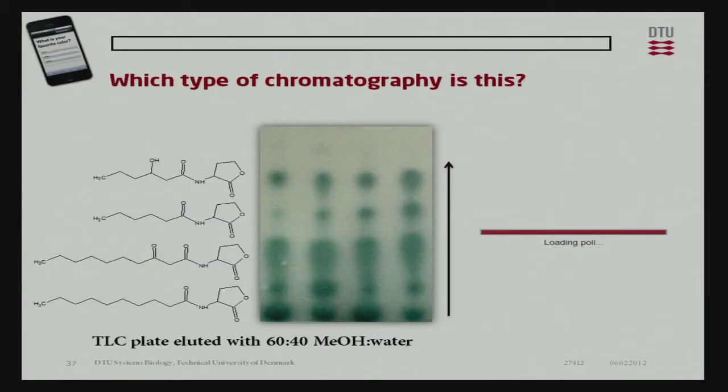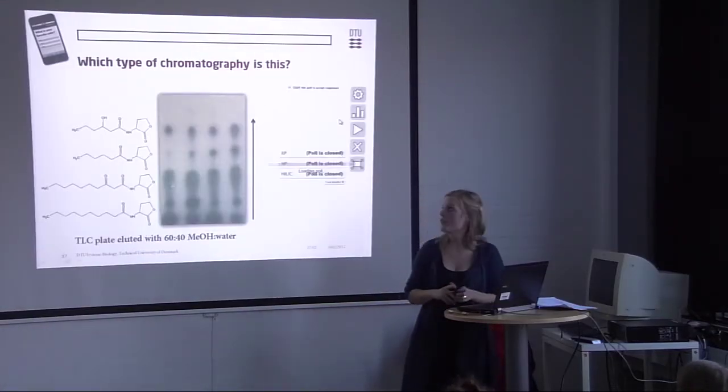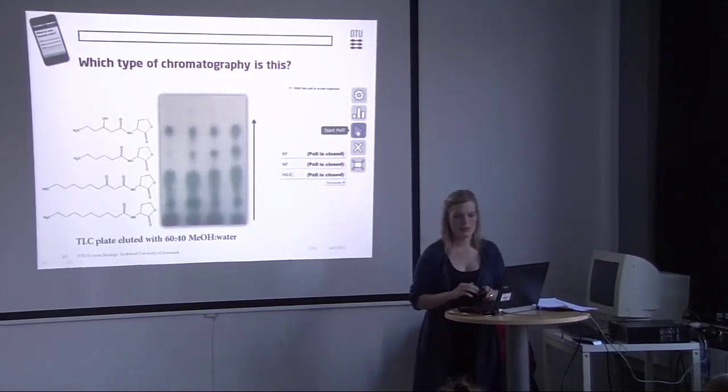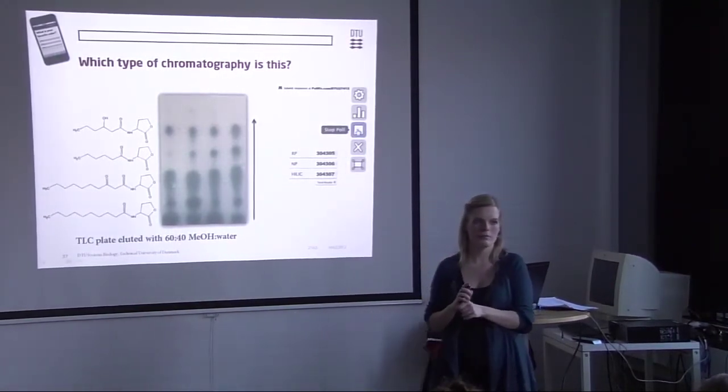So now we're going to start a poll. Hope that works. Here you have a TLC plate, which is called thin layer chromatography. Have you heard about that before?